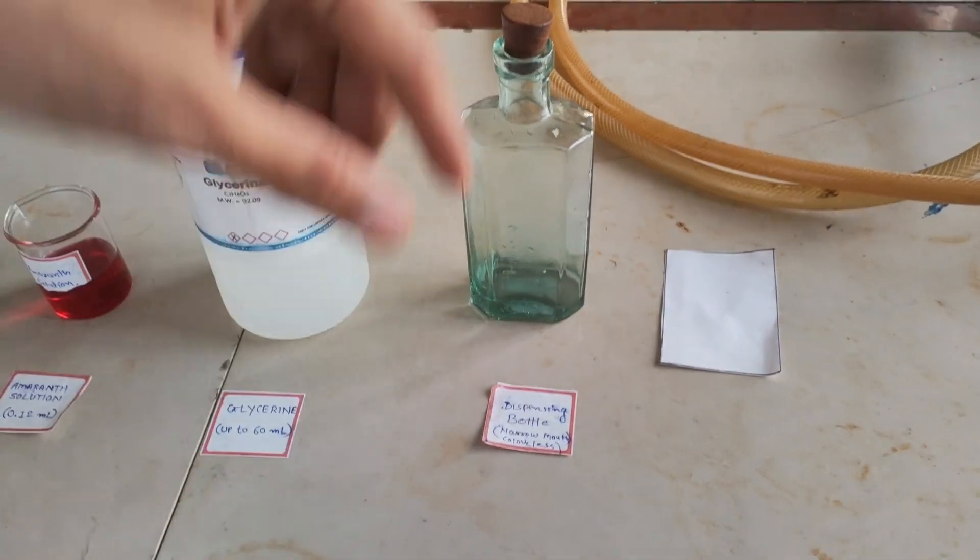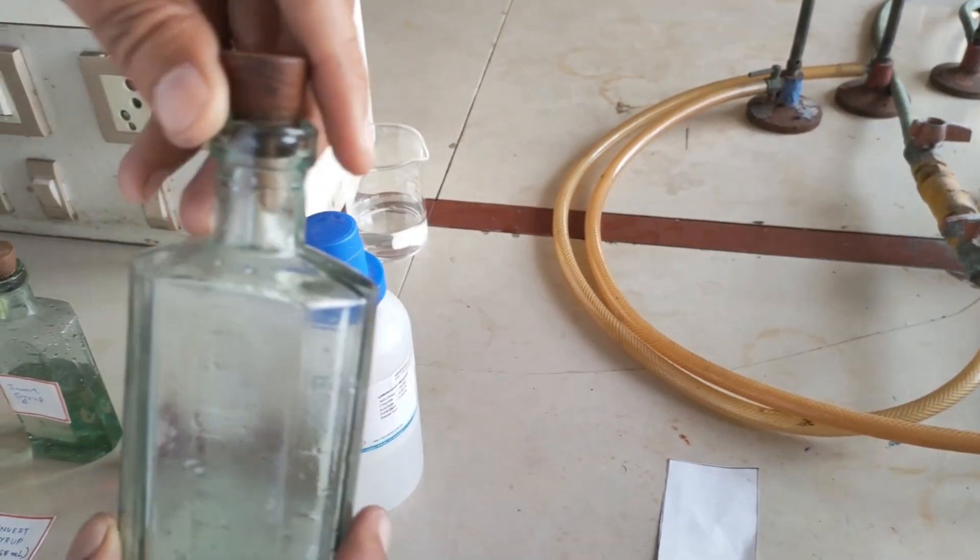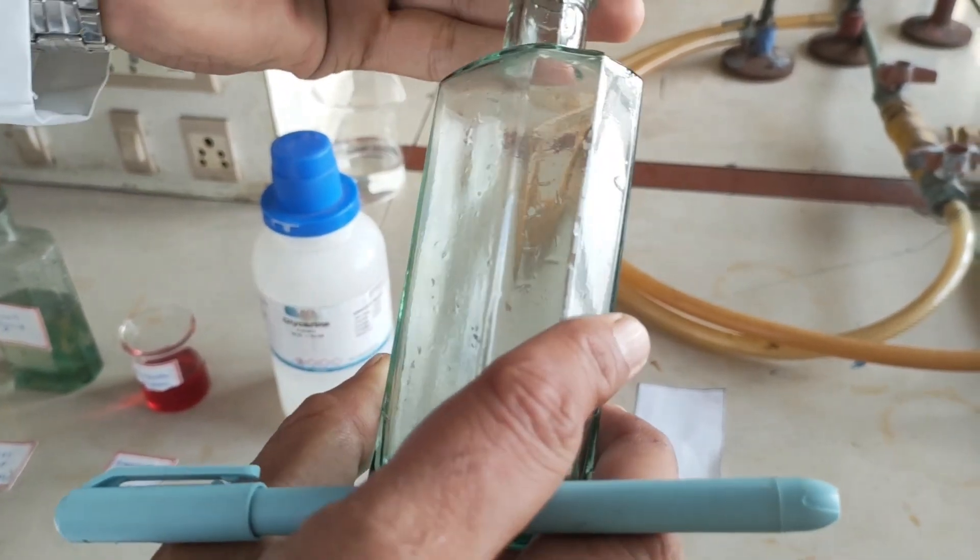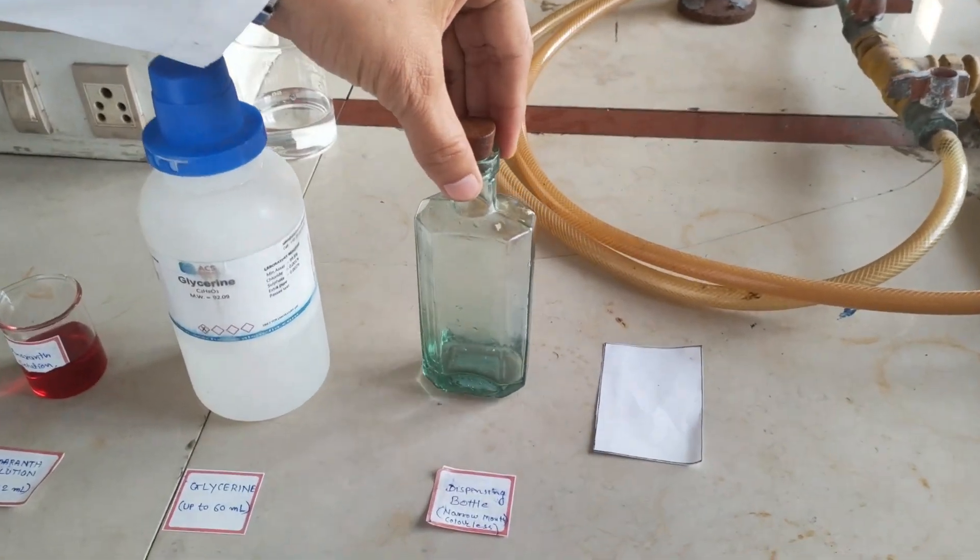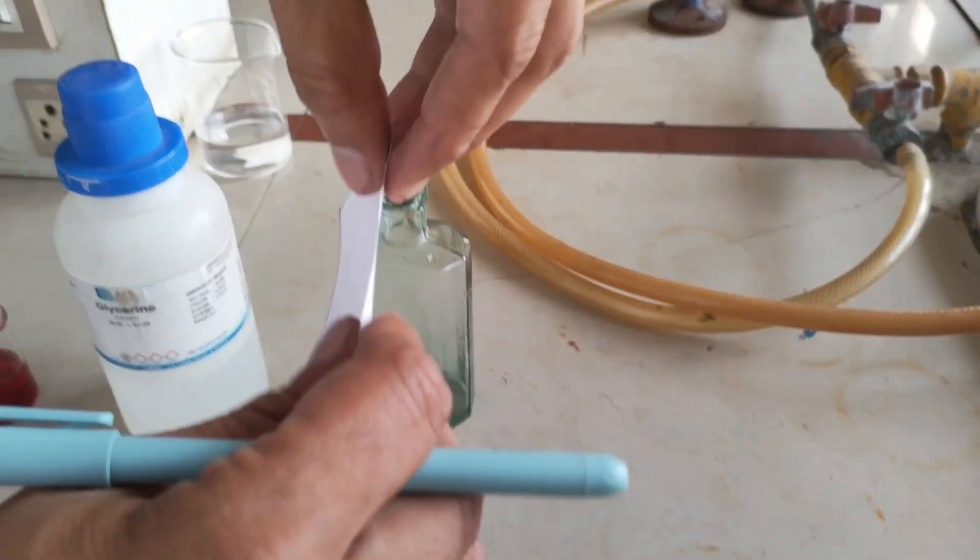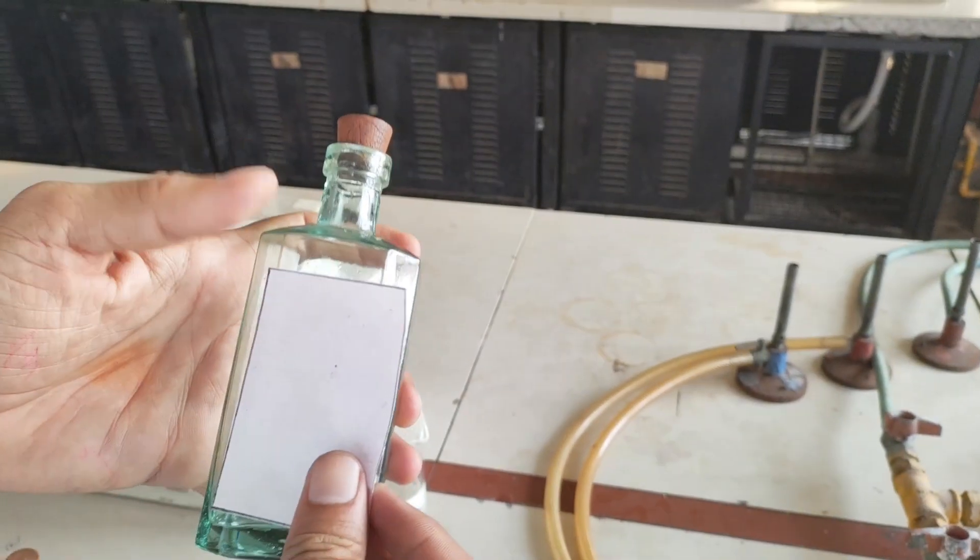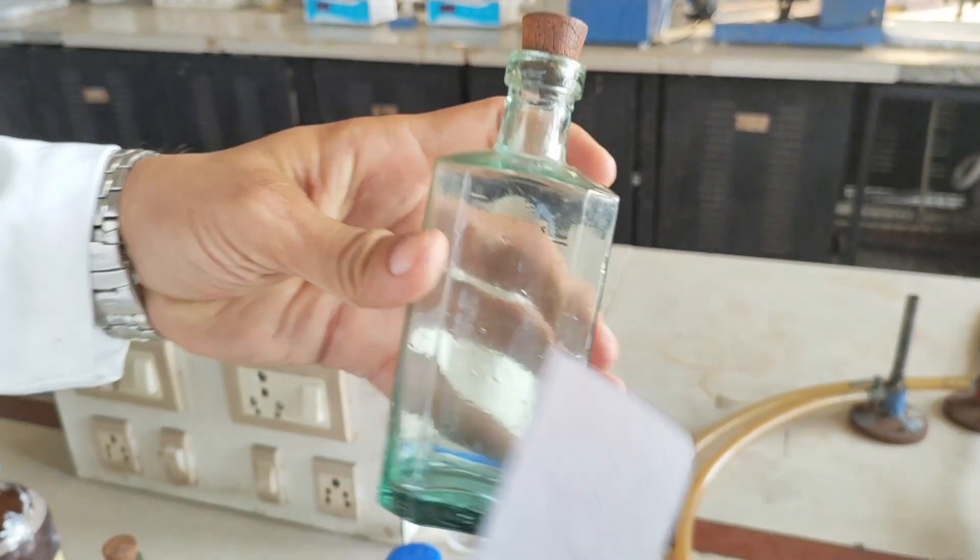After preparation we are going to dispense our formulation into a dispensing bottle, a narrow mouth colorless dispensing bottle. We are going to paste the final label over this container with appropriate information.